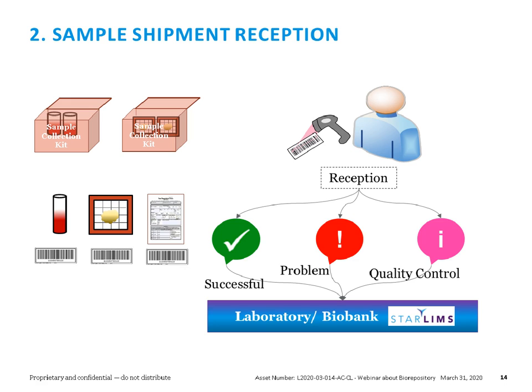And at this point, with any of the ways that we can scan any of the barcode labels that we potentially could have in the system, we are able to reconcile and say, yes, we have it. There also always needs to be a solution for what if I get a sample that has no barcode label. So there is always a solution for that. You can manually enter whatever the ID of the sample is, or do a manual, ad hoc login of the sample that you received. That would be perhaps the exception. But especially for laboratories with high volume, you need to have a process in place for your shipments that allows this to be done in a very efficient way. So we have many solutions for that.